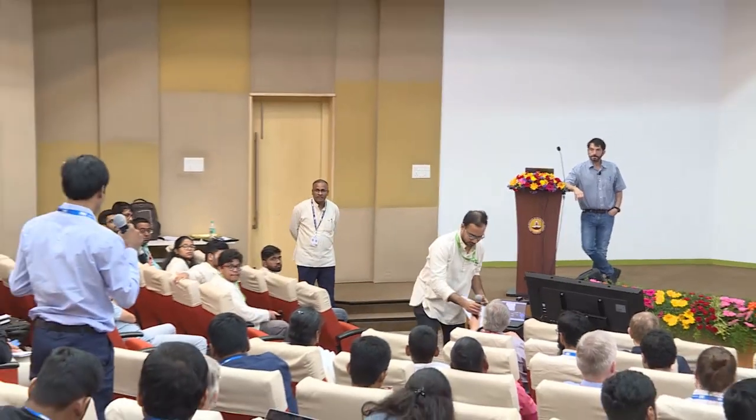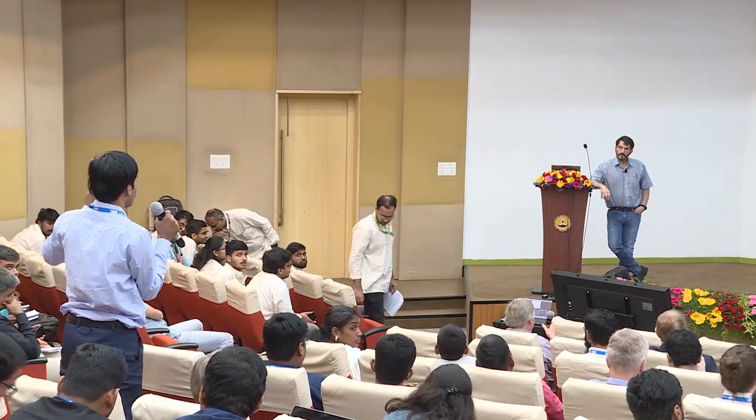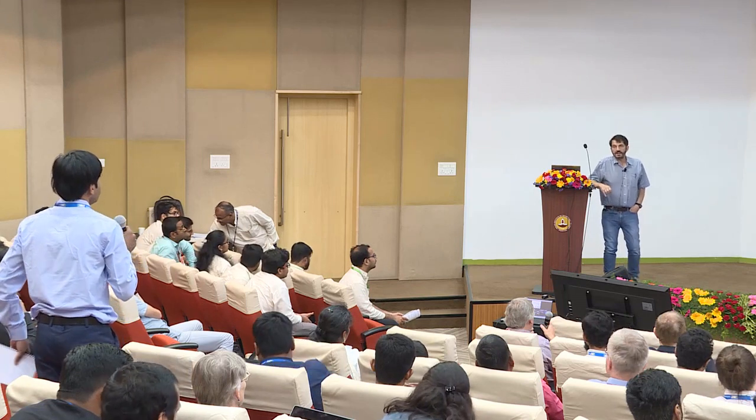My question is, how have you controlled the droplet volume in the double emulsion system? Because you have taken a fixed needle size, where the droplet volume is varying. So how have you controlled the droplet volume? You control the droplet volume by, it's made actually with a well-known hydrodynamic instability, the Rayleigh-Plateau instability. So it's a balance between viscous forces and surface tension forces. And that just sets itself as the droplet size. It's automatically controlled.